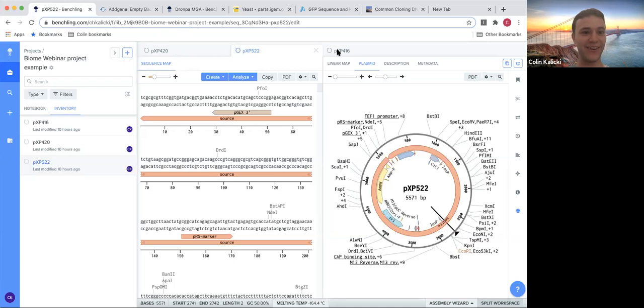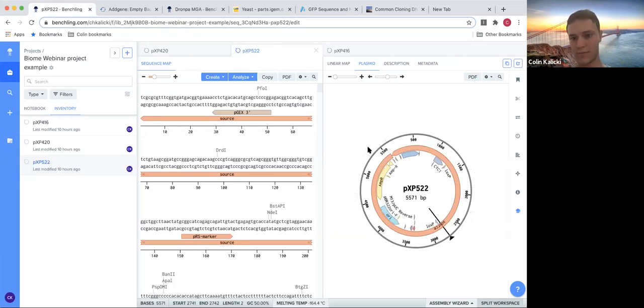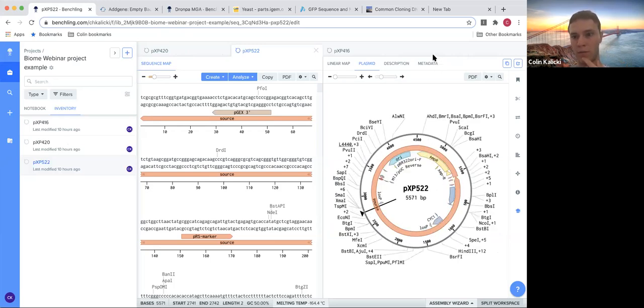Cool. Yeah, awesome. So let's get started. So I'm going to introduce you first to this. This is our first plasmid. It looks pretty complicated, but pretty much we want to find a basic backbone. A basic backbone is going to have certain qualities.